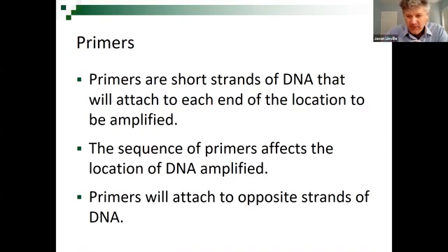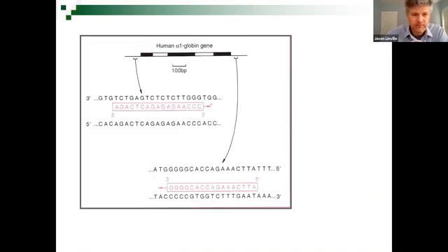In other words, if I want to amplify D5S818 or whatever, an STR, a short tandem repeat location that will give me one pair of numbers, in the human genome, I look up the human genome in that area and I order a primer that will attach to one end, and another that will attach to the other end. I tell a company that makes primers, they manufacture it in the lab and then they send me a tube with millions of copies of that primer in it. And then that is what I squirt into my amplification tube, one of the four components, when I add the primers.